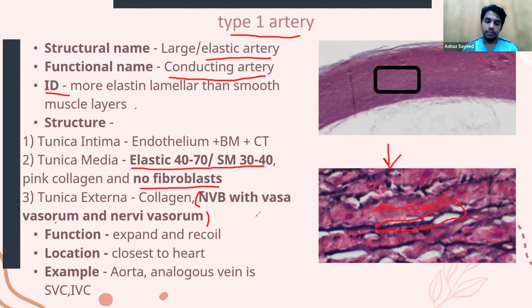See your arteries, especially the aorta. It's a pretty thick artery. Its wall thickness is also huge, and you cannot distribute nutrients via diffusion in such a thick wall. You need extra blood vessels within the blood vessel to supply the wall. You get me? For example, this is a huge blood vessel.